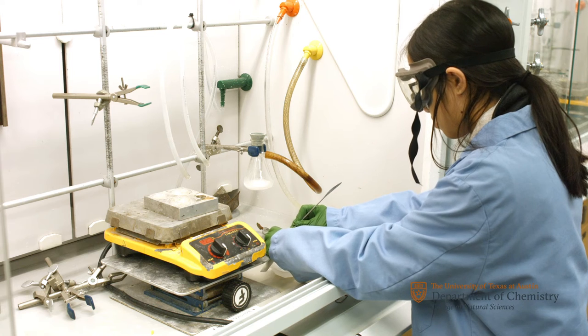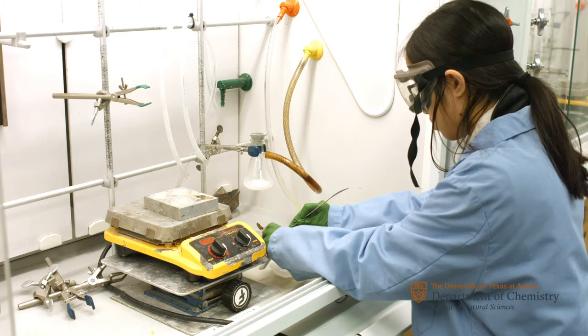Isolate the solid from the Buchner funnel and let it dry over the week. Once dried, obtain a melting point and measure the mass to determine a percent yield.